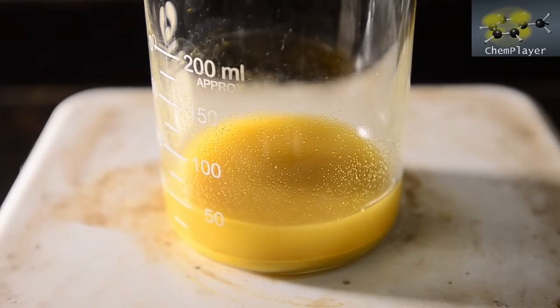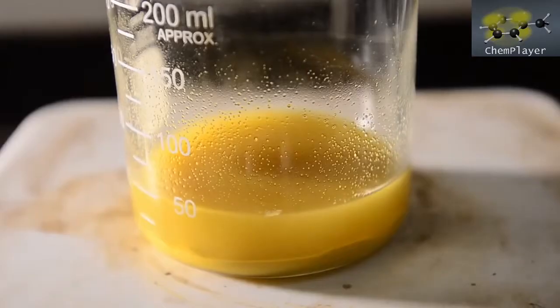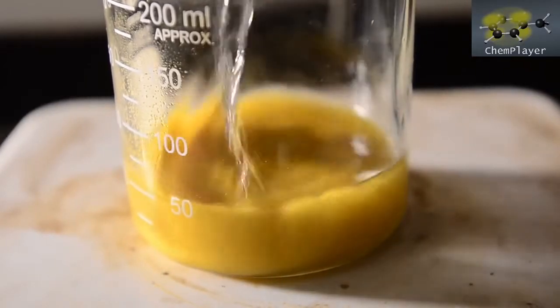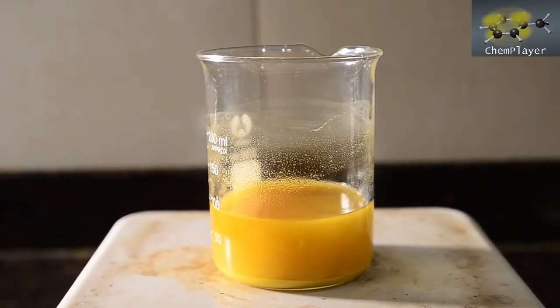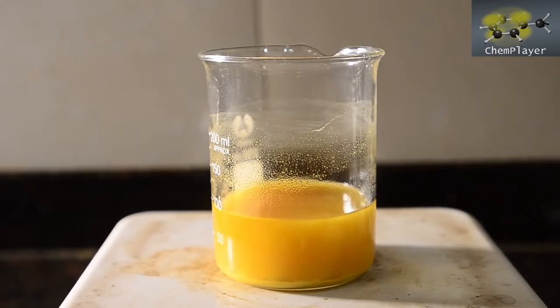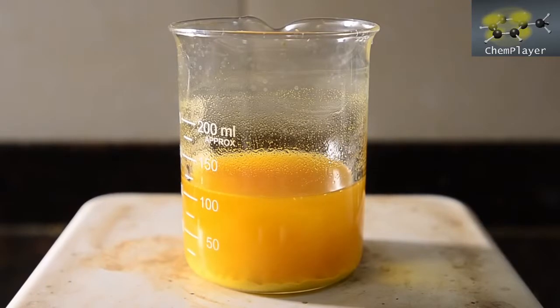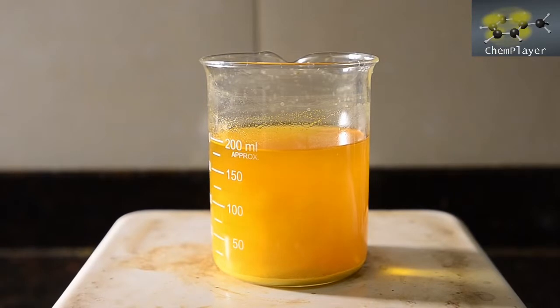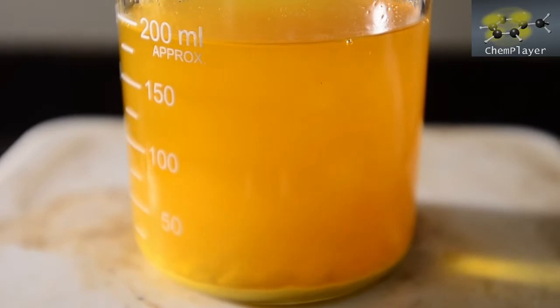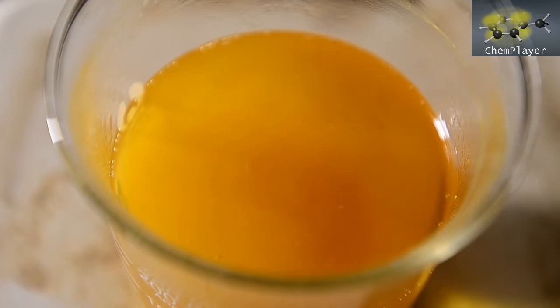Let's start heating. Soon we've got some bubbles appearing as the ethanol starts to boil. Well, it's obviously not that soluble, so we'll need to add some more. Getting hot again, and it's still not very soluble. Okay, let's go nuts and get 200 ml of ethanol in here. Some of the solid has definitely dissolved, but lots remains, either because it's not very soluble, or perhaps because it's an impurity.